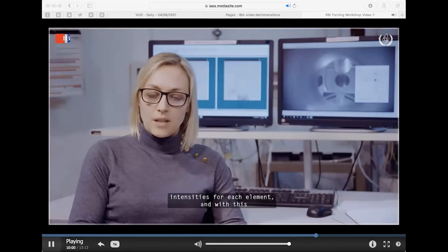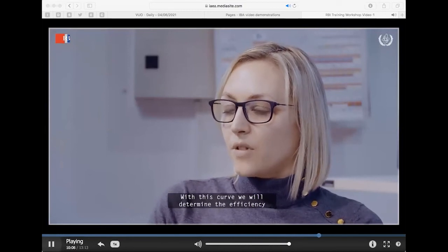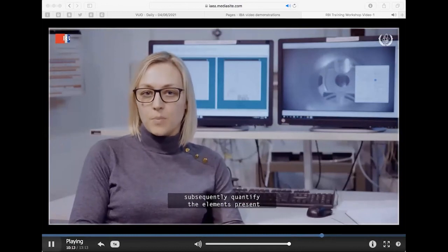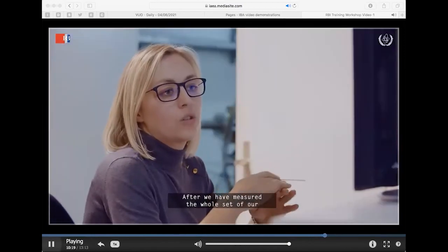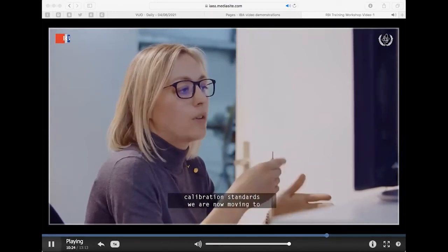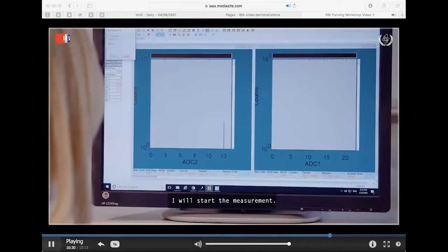The data that we collect after measurement of each standard will give us the X-ray emission intensities for each element, and with this data we will create a calibration curve. With this curve, we will determine the efficiency of our detection system, which will enable us to subsequently quantify elements present in unknown thin samples. After we have measured the whole set of our calibration standards, we are now moving to our real samples of unknown composition. So right now I will start the measurement.